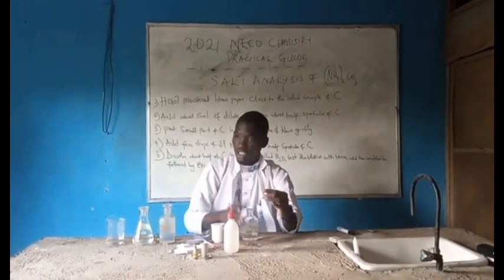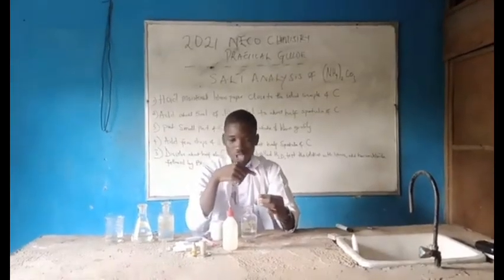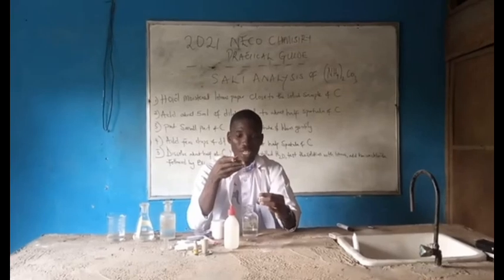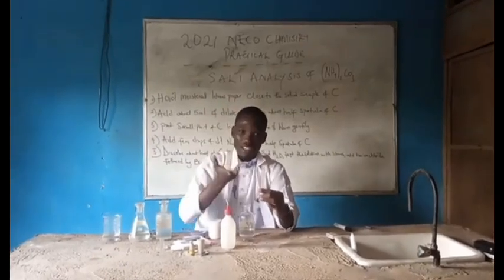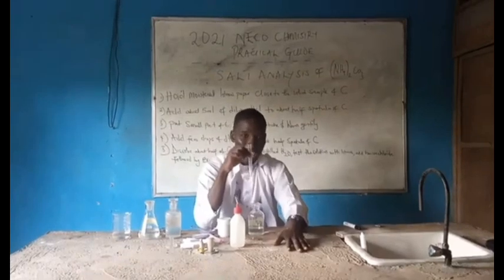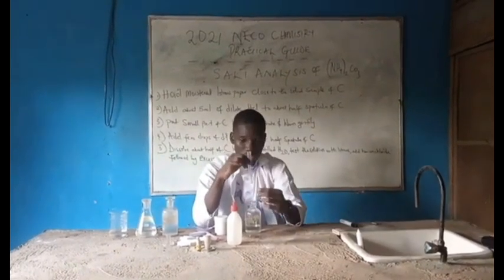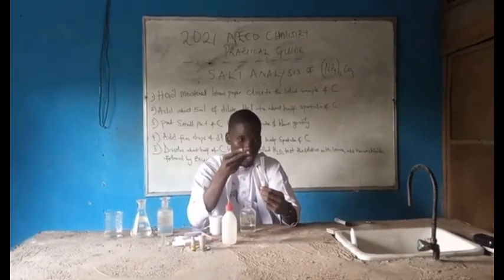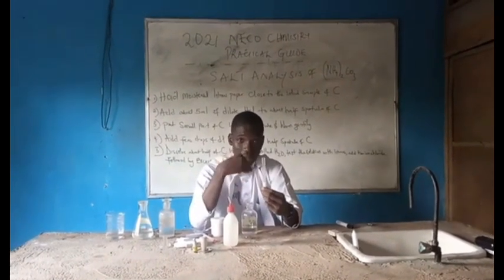As you can see, what are you observing? It is called an effervescence. It evolves because anytime you get a mineral, when you open it, a particular gas will come out. It is called what? Effervescence. And with this particular effervescence, with what you can see with your eye now, it's turned what? Lime water what? Milky. That's the observation.